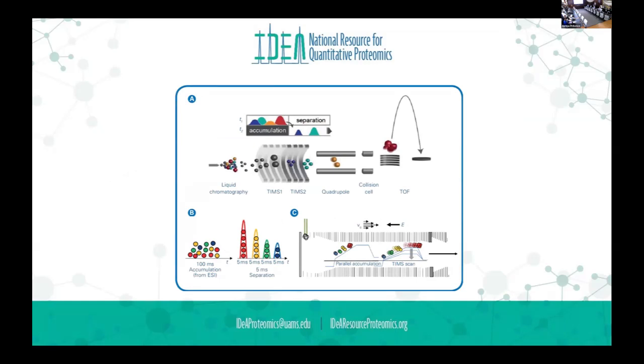Another instrument that's kind of leading the charge on this is the TIMS. Our experience in the lab isn't what everyone else's experience is, but we haven't had a great experience with the TIMS.